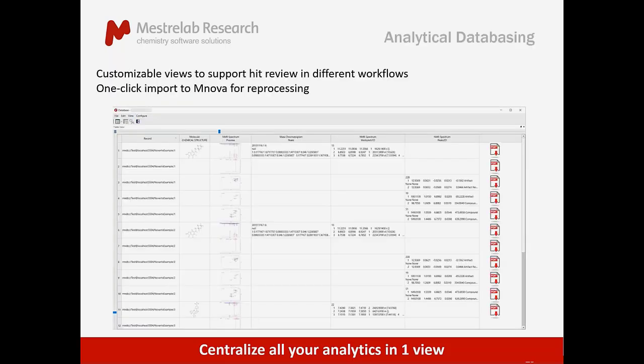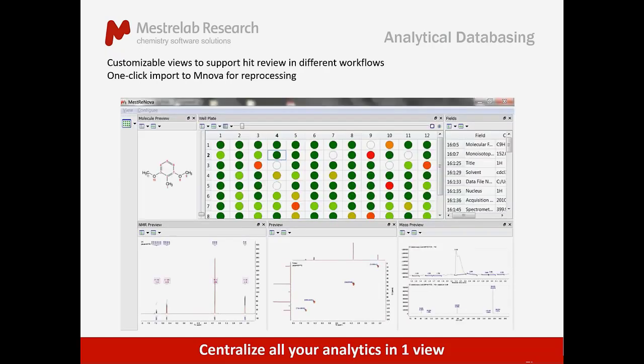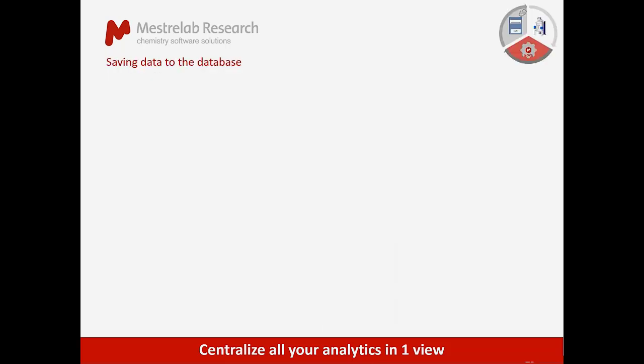You can customize how you view the results. So there are many different ways in which you can visualize the results depending on what you're trying to achieve or what your workflow is. And this is too advanced for the session we're going to do today. But if you had an interest in exploring how to improve the result visualization, you can contact us separately, and we can support you with this kind of thing.